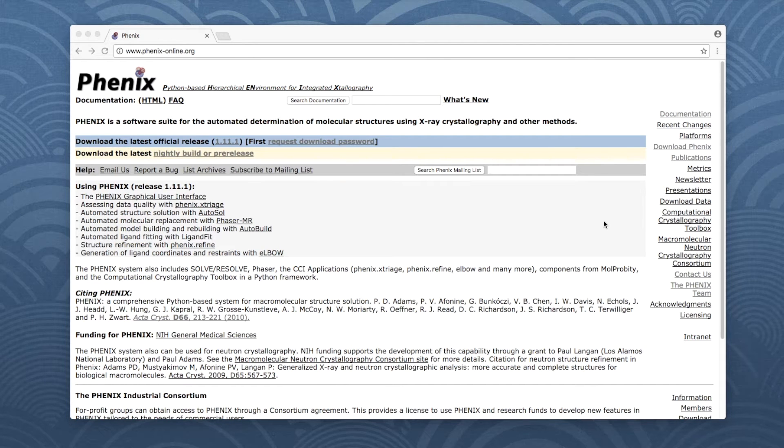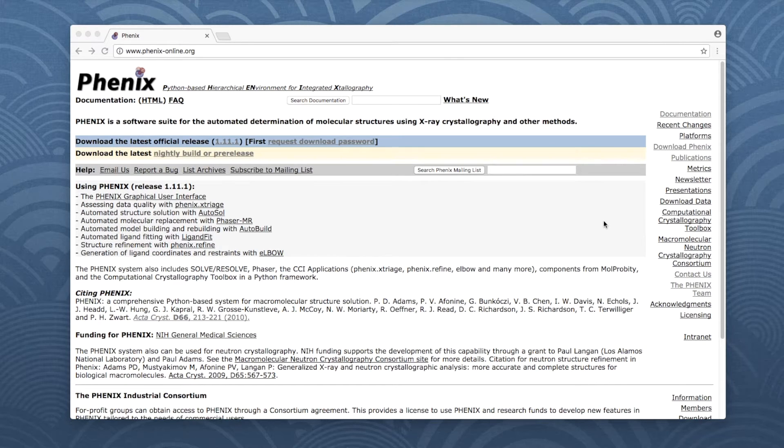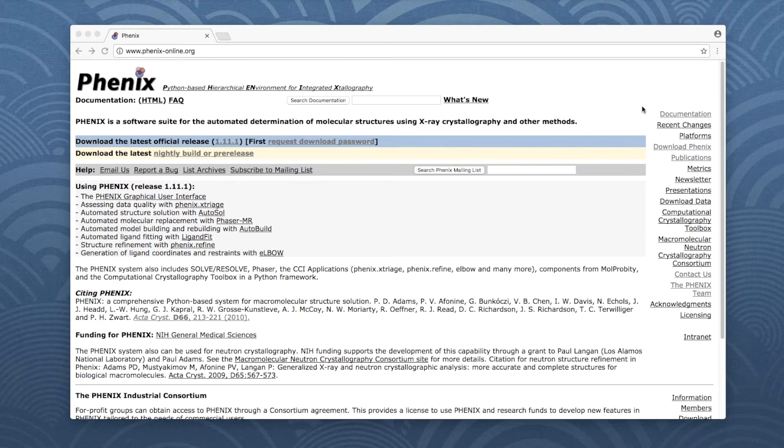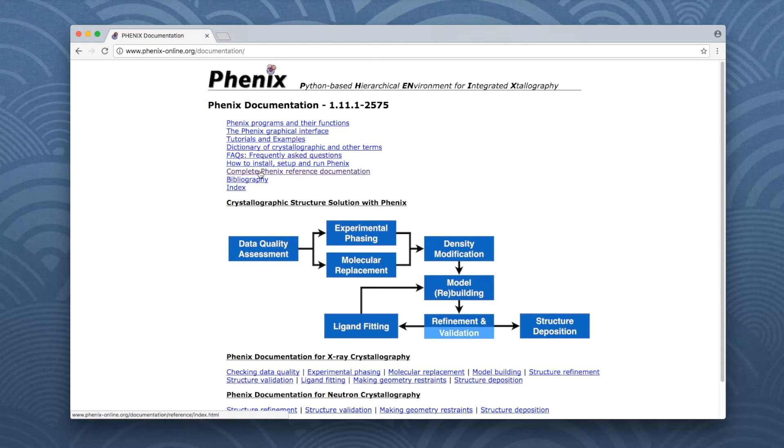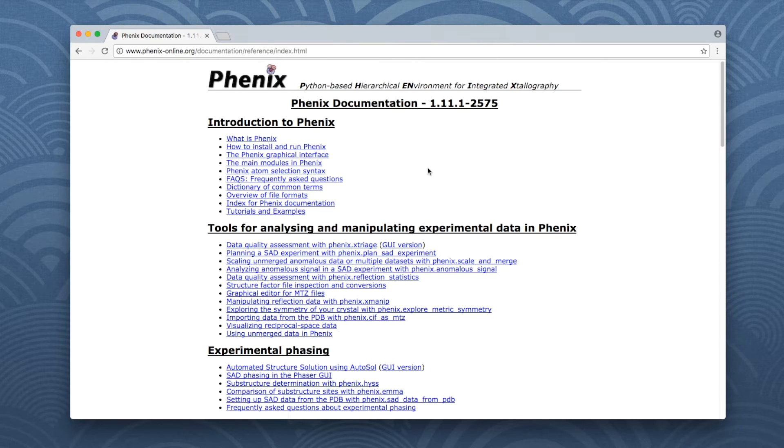First of all, here is where you can find the summary of the phenix.refine parameters. Open the Phenix homepage at phenix-online.org. On the right-hand side, click on the documentation. Then click on Complete Phenix Reference Documentation from the list on top.